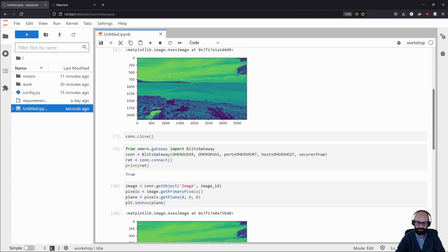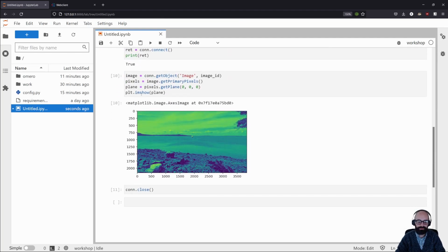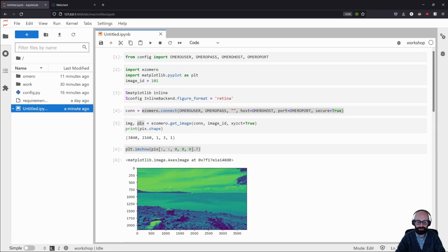And I'm not going to be doing points of comparison with the default Python API, but in general, it's always going to be simpler. And one thing we also try to do is always have inputs and outputs be things that you are going to be using elsewhere. So NumPy arrays instead of just image objects. So in this case here, the only time you actually get a NumPy array is all the way when you get the plane. So we just wanted to get the actual data as fast as possible.